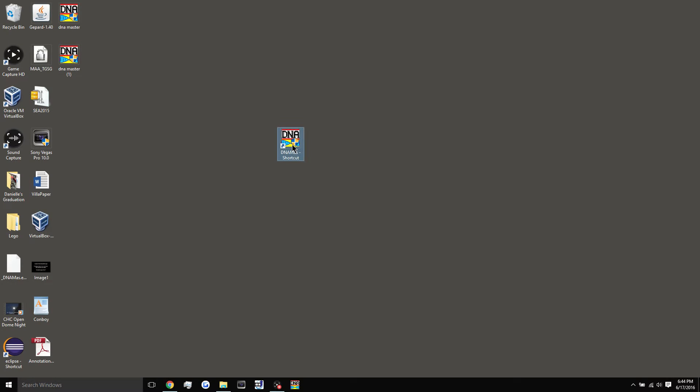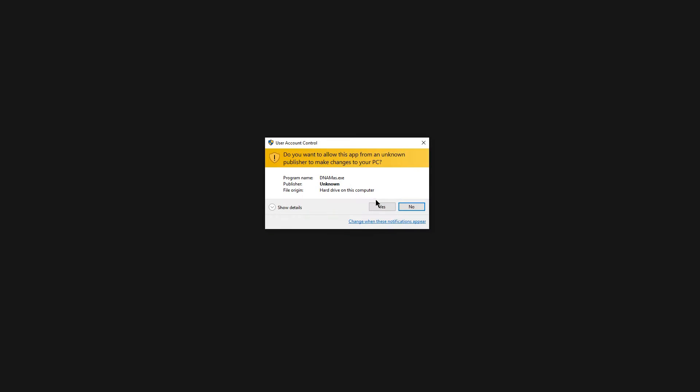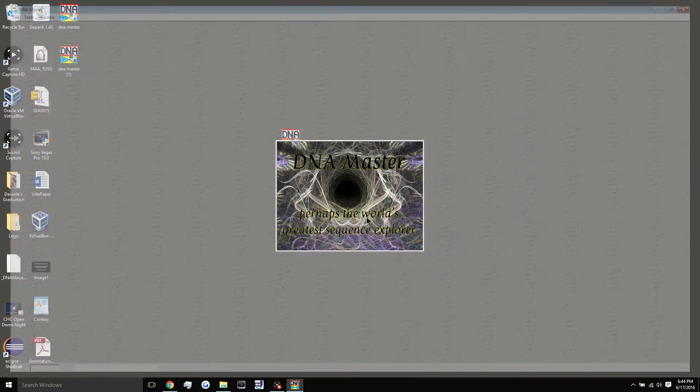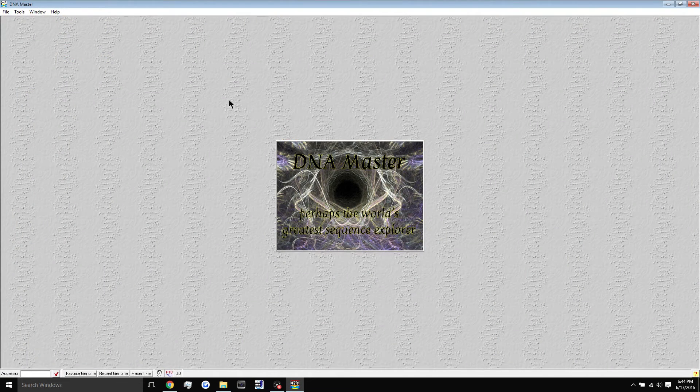And then you should have no problem simply opening it up. So every time this pops up, just click yes, and it will load up. And there you go. That's how you install it and get it running on your PC.